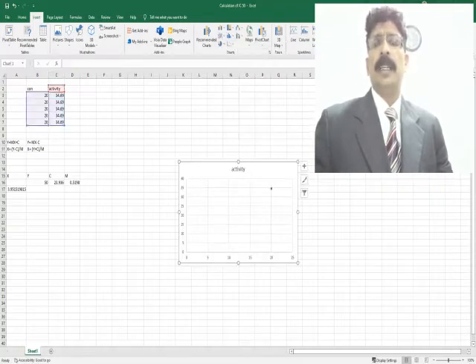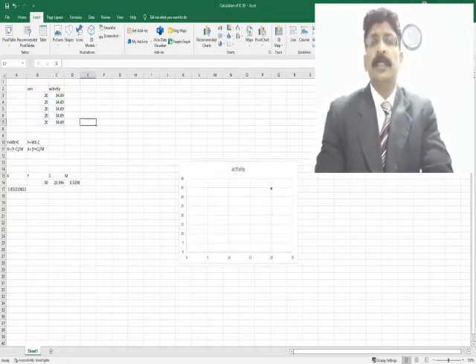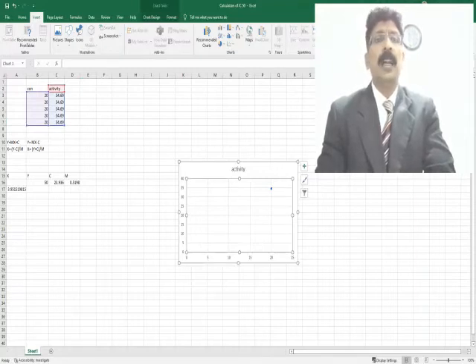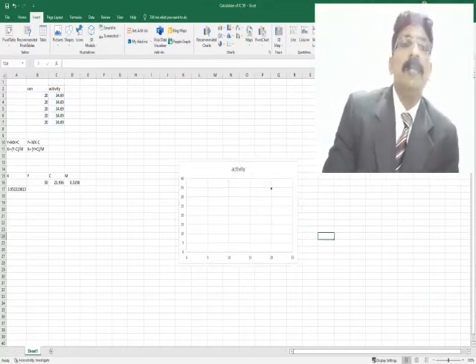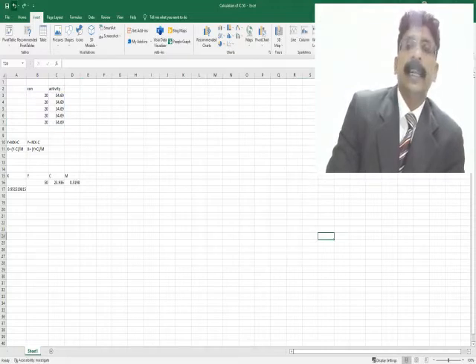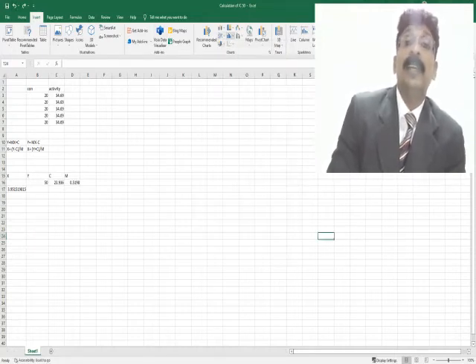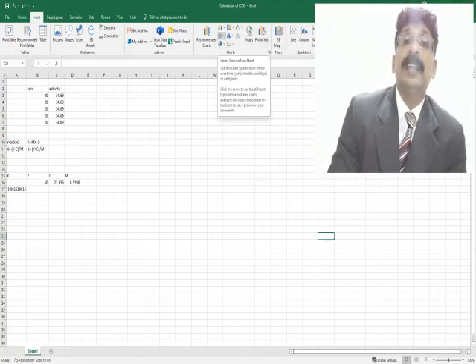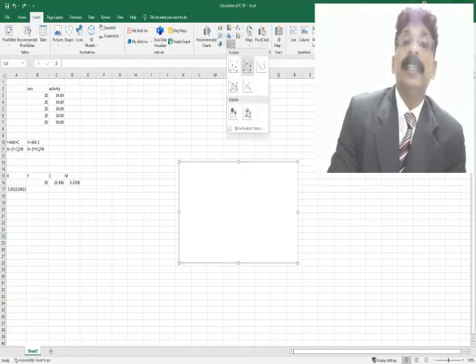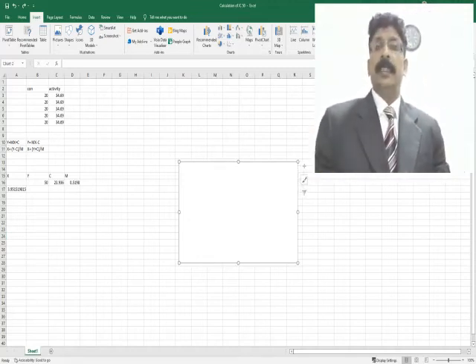And here it has come. Now the activity is not needed, and now you see what you have to do. Before taking this activity itself, we have to clear it, because my old parameters are coming. What I am doing, just observe here: I am taking insert, and I'm coming to this graphical expression, and here I'm selecting this place, and it came blank, nothing is there, understand?